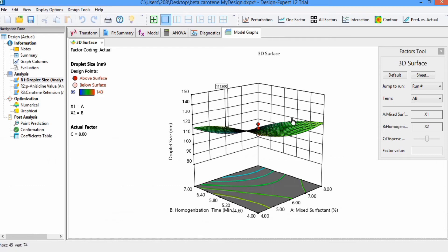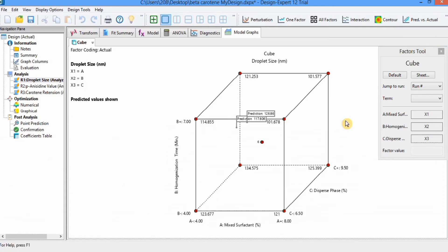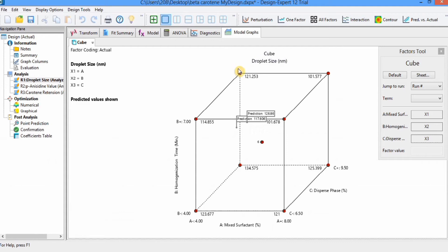Another graph type is the Cube. You can form cubic graphs of different terms. It is not mostly used, but if you want to use it, you can make it using these options.